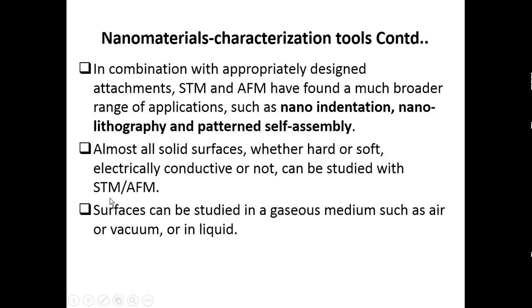So that is why STM and AFM have that advantage, because they can be used for knowing the topographic information of the surfaces, whether the material surface is hard or soft, or electrically conductive or not. Surfaces can be studied in a gaseous medium such as air or vacuum, or in liquid. So whether the surface is in a gaseous medium, a vacuum, or a liquid medium, the surface characterization can be studied with the help of these two types of microscopes.